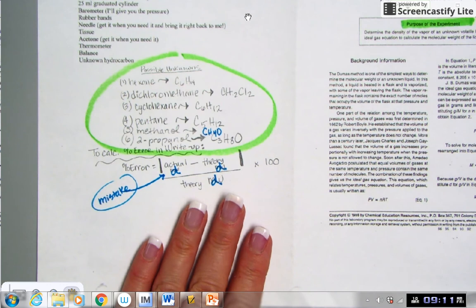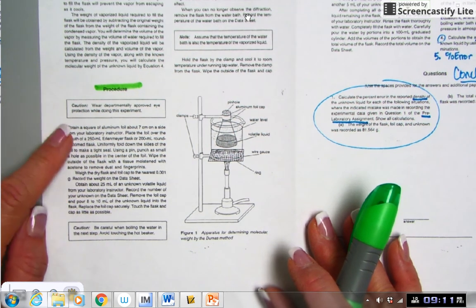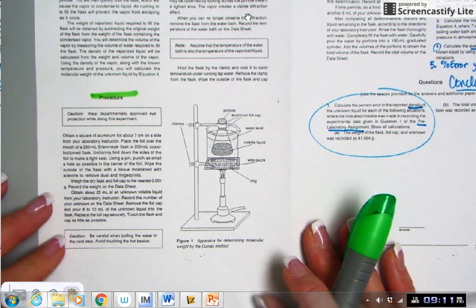All right, so then the next section will be your procedure. Remember that your procedure can be word for word, is fine. And I would use a numbering system. I would not do it in the paragraph form here, but I would use a numbering system and number or bullet each step in the procedure following what you see here.